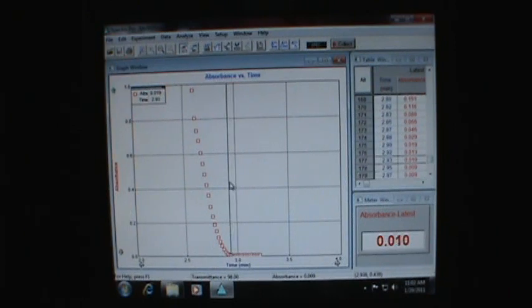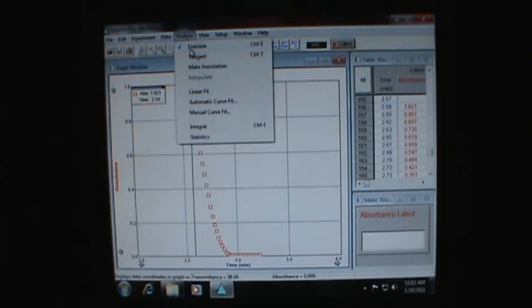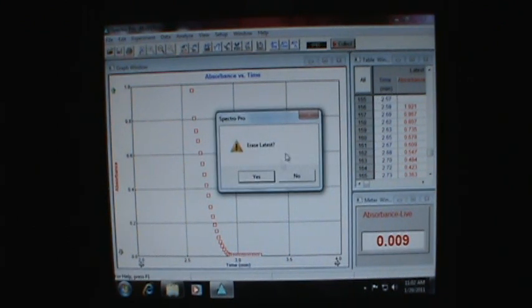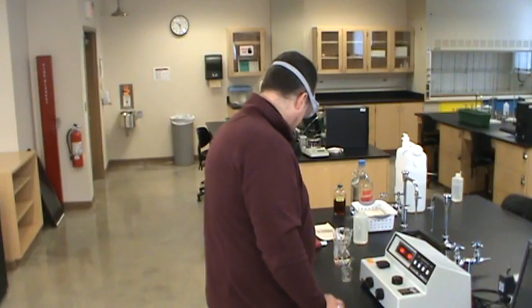Once you're ready to start a new experiment, it probably doesn't hurt to turn that examine off. We could rescale the axis before we start, but all we really have to do is hit collect. It'll pop up with this box asking do we want to erase the latest, say yes, and off to the races one more time.